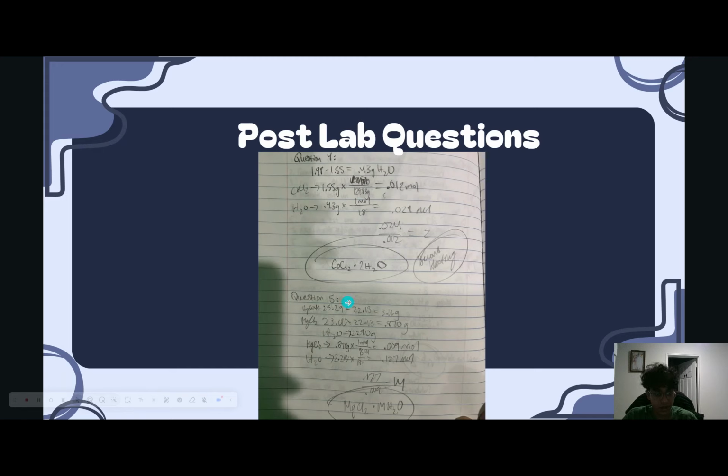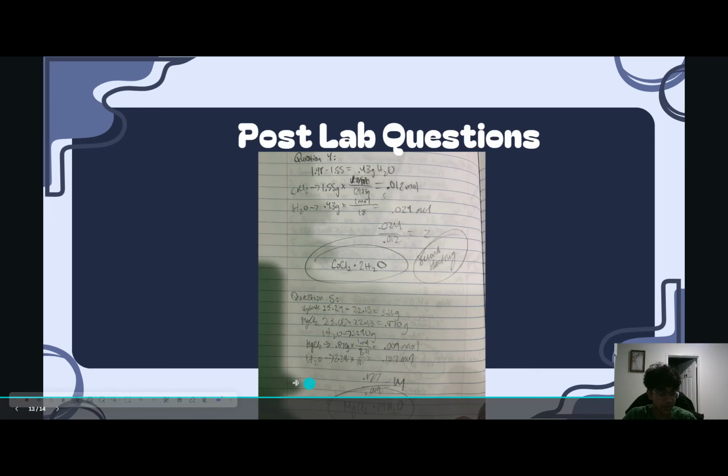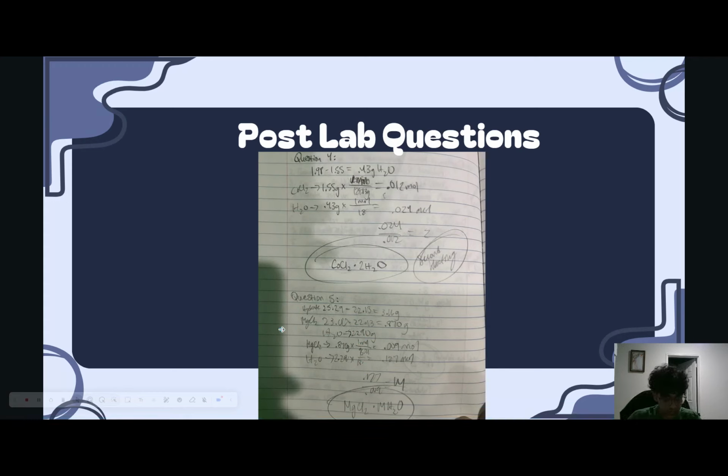And for question 5, it was the same kind of idea, but it started off with having the crucible as the main mass, and then we had to find the hydrate first, and we found MgCl2, which is 0.87 grams, and H2O, which was 2.290 grams. And then MgCl2 had moles of 0.009 moles in the hydrate, and H2O had moles of 0.127. So we put 0.127 over 0.009, and we got 14 as a coefficient for H2O in the hydrate.